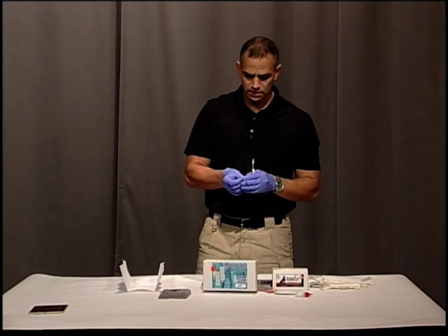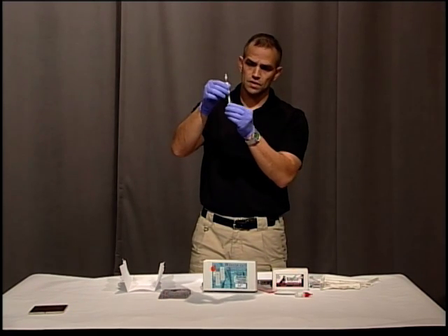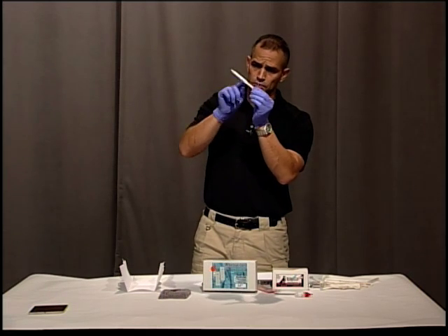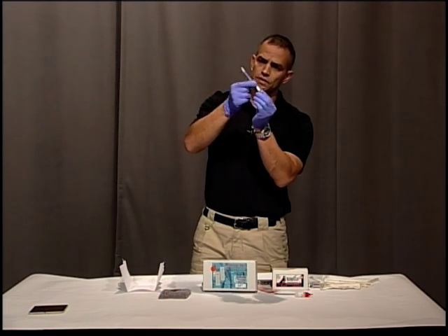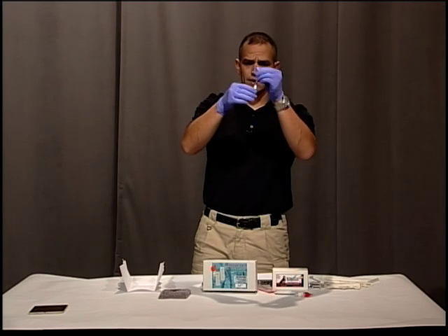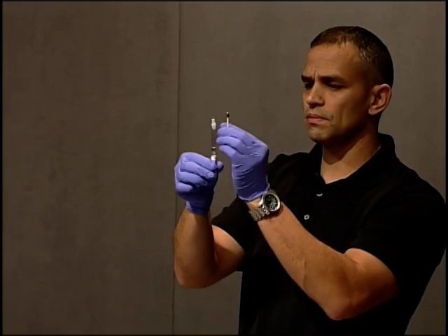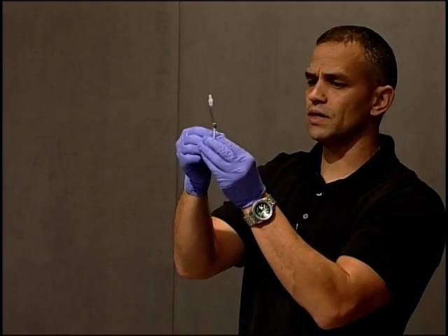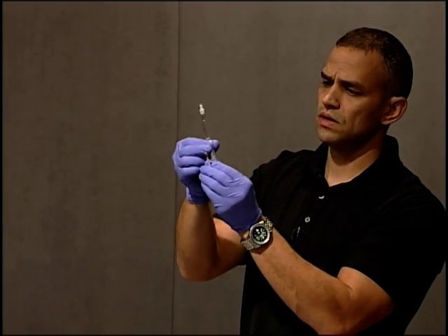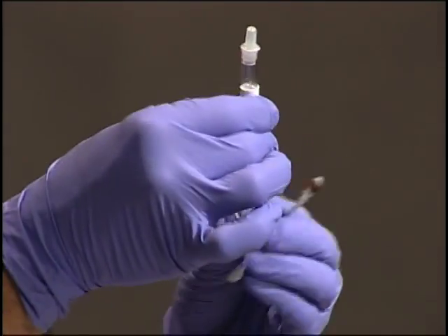Now before we test that, I'm going to go to my dropper. Inside the dropper there are two ampules — one on the bottom, one on the top. When you break them, make sure you're holding it up, because if you hold it upside down when you break them, it's going to leak out before you get to put it on your stain. I'm going to break the two ampules — the bottom one first, using the little paper sleeve to make sure it doesn't poke through, then break the second one.